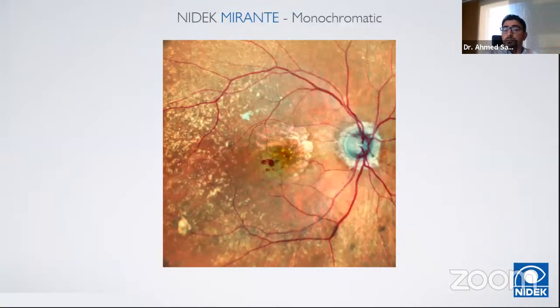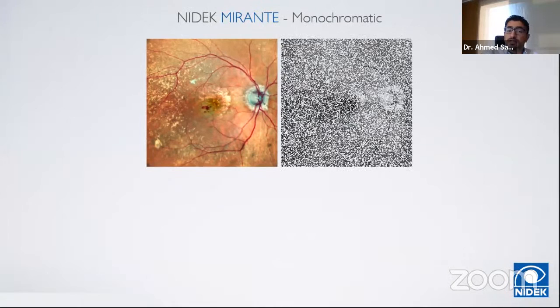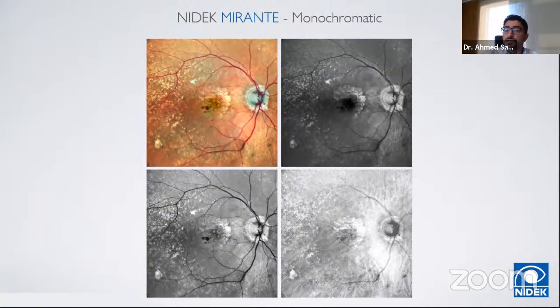So, as I mentioned, this image is taken through 3 different lasers. Through the software, after capturing the image, you can even separate these images, and you can see the image that is captured by each individual laser separately.